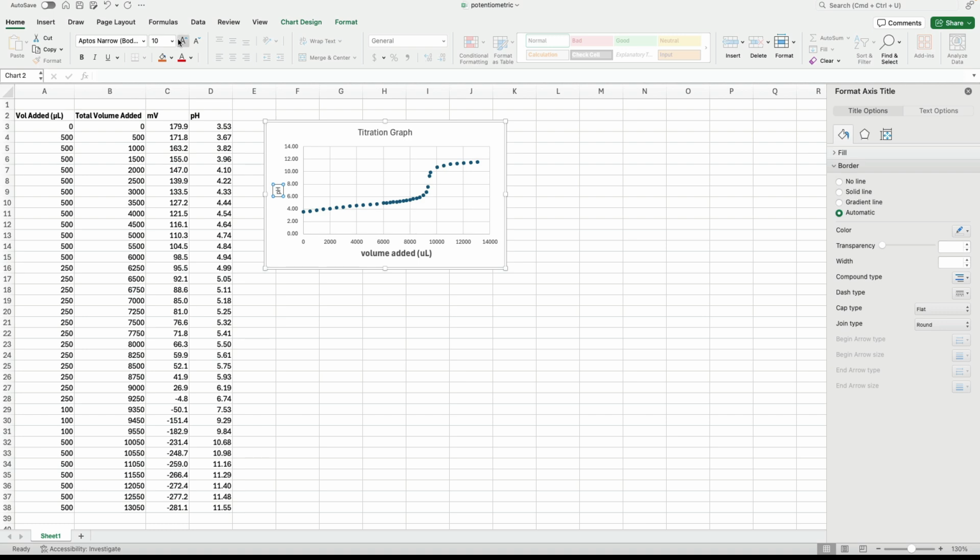I'm just making these readable. I know some of you can read stuff this small. I can't. I need my reading glasses otherwise.